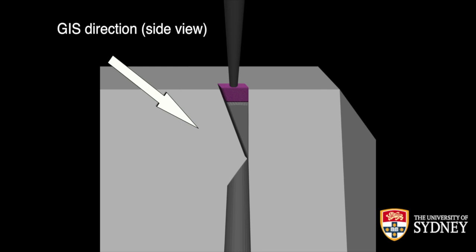But always bear in mind that you would like to have no shadowing in terms of where the gas goes, and generally have the gas going at the same angle on every facet that you're trying to deposit on, as otherwise you're going to get obviously uneven depositions. Unfortunately, we usually can't reach the optimum conditions, especially while you're doing a lift out, because you have your sample still on the micromanipulator. But again, that's a topic for another tutorial.